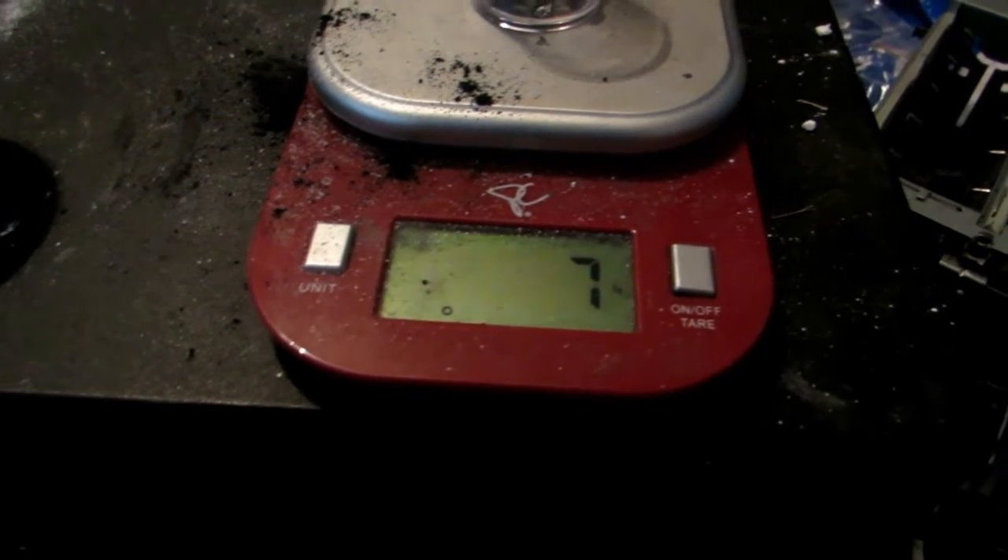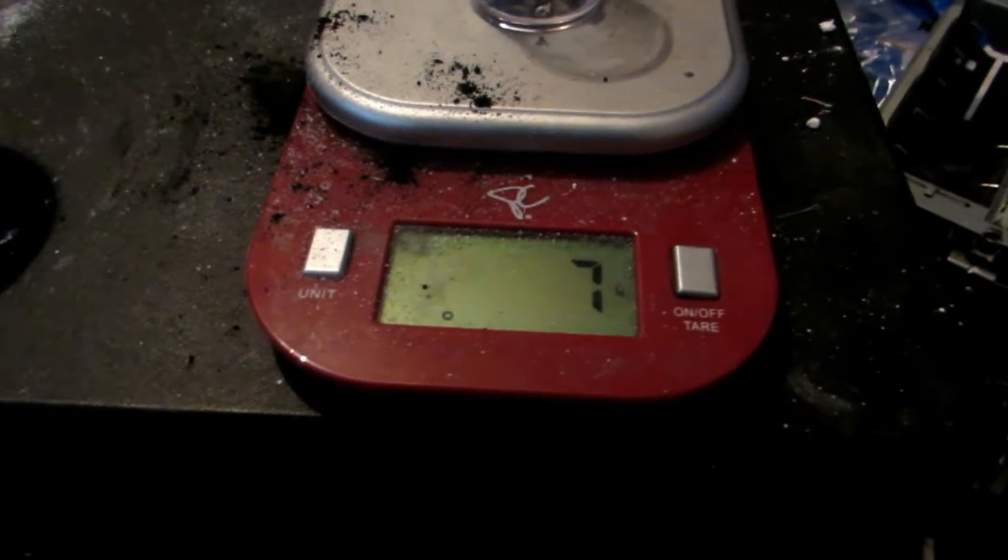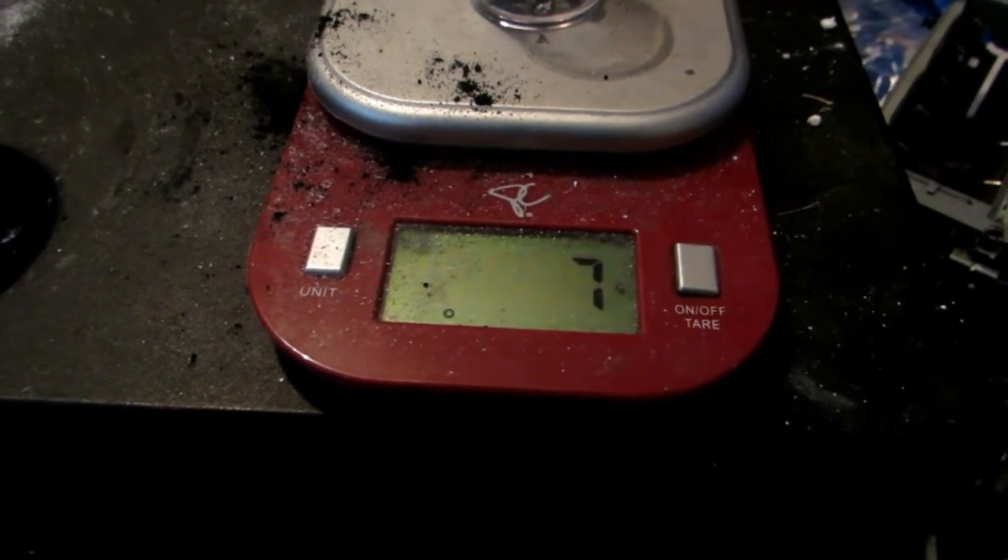This isn't actually a terrible yield as thermite reactions are typically very wasteful, because there are lots of really tiny pieces left in the reaction mixture that you just can't retrieve. So this isn't too bad, and I'm extremely happy — we got lots of manganese metal.